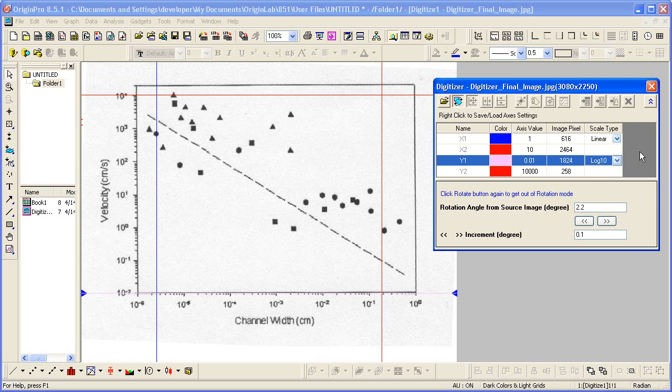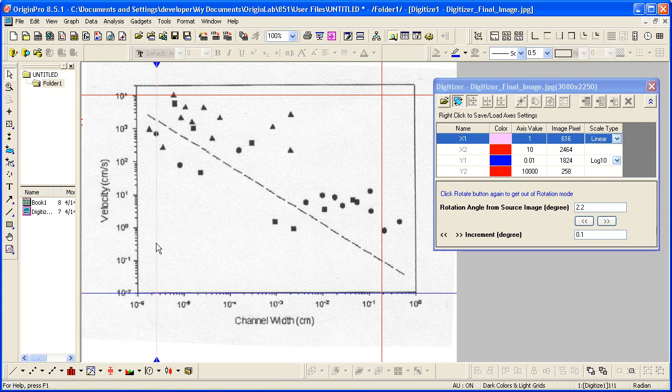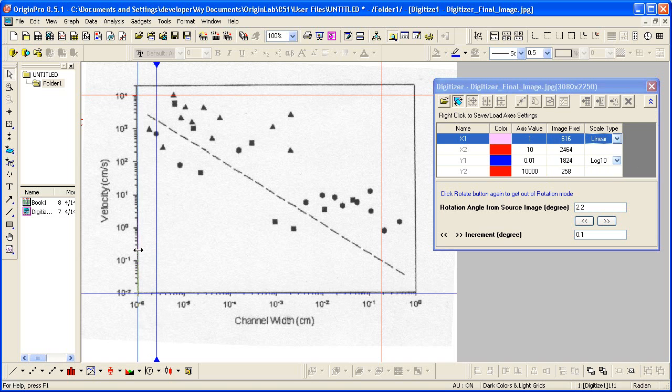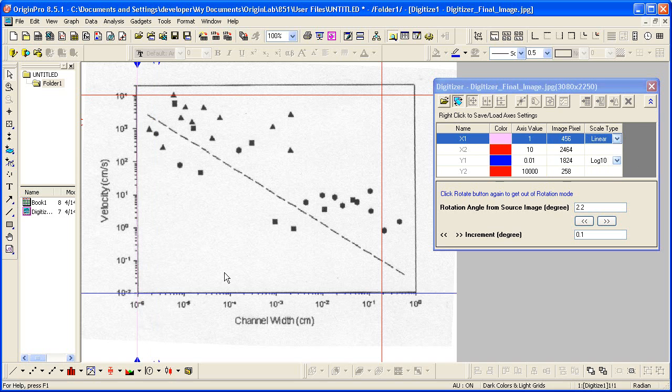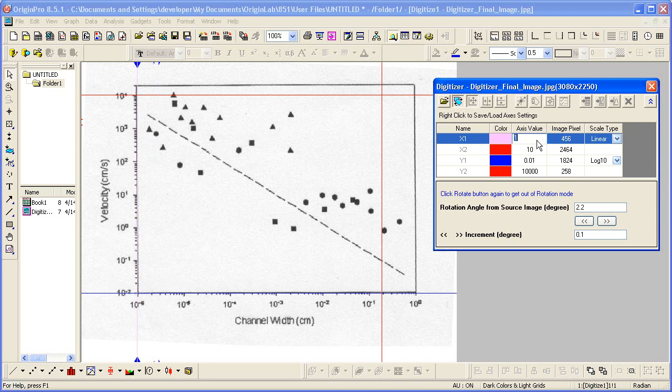And then I'm going to repeat those steps for my X scale. So clicking on this, dragging this over here. And that is 10 to the minus 6. So that's 1E to the minus 6.